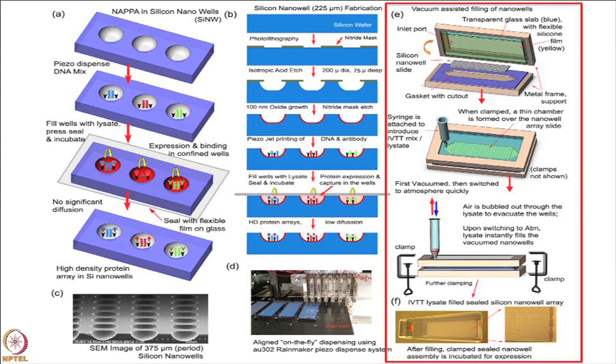Okay, so what Peter did to seal these wells, he developed a system where he had two plastic laminate surfaces, flat plastic surfaces that are like this. And sandwiched in the middle, he has a form of oil. A clear liquid oil. And so then what he does, that whole system is connected up to a pressurized system. And so the minute we finish putting in the expression lysate, he adds pressure to the oil. The oil then takes the plastic and does that. It kind of forces it apart and essentially forces the plastic to seal the nanowells. And it does so instantly.